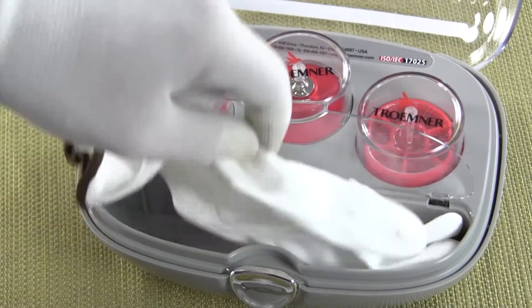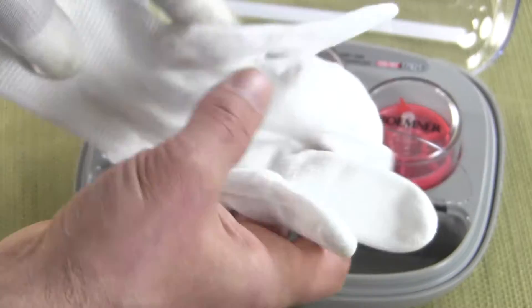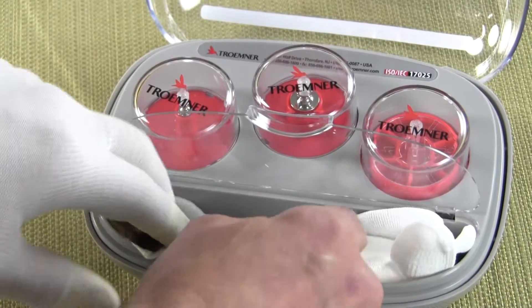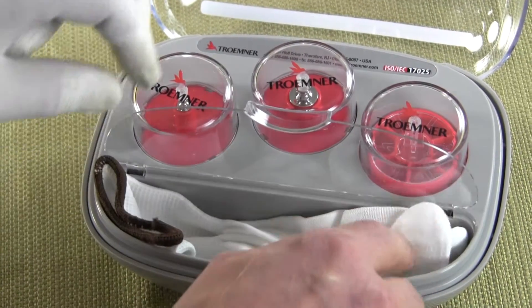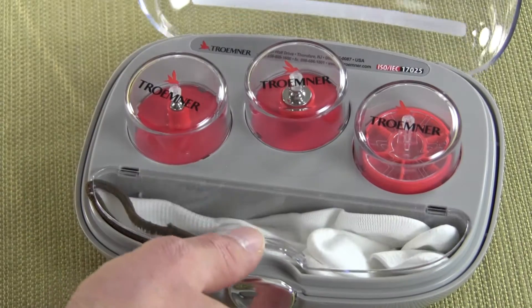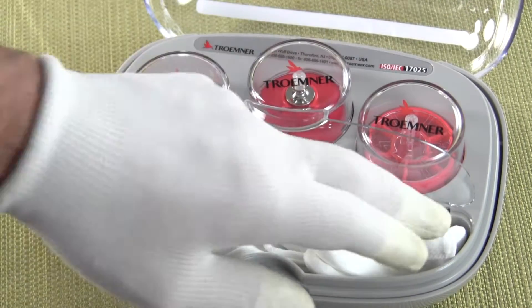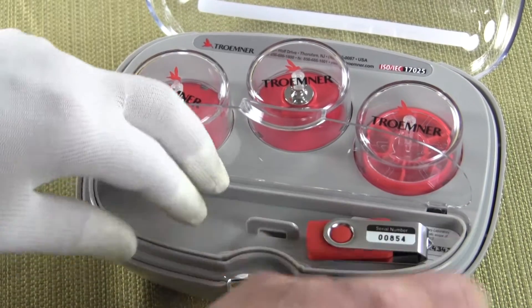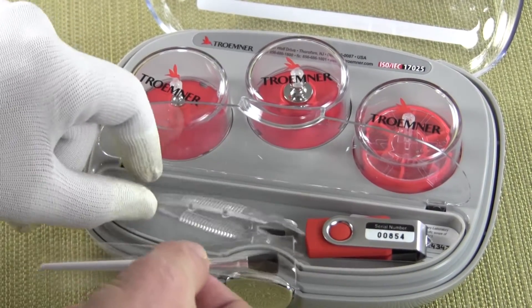Underneath you have a glove like the one I have on — it comes with one glove. You should never touch the calibration weights with your fingers because the oil in your skin will change the tolerance of the weight. It's a really nice setup.